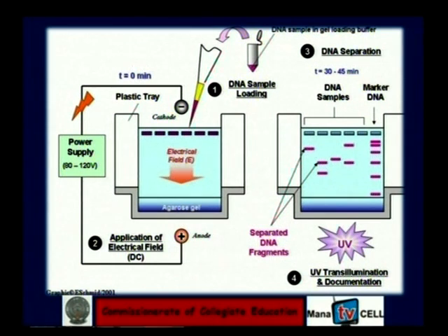After the explanation of the components, let us go to the instrumentation. For the instrumentation, we have to prepare the sample. For the preparation of the sample, we have to weigh the required amount of the agarose and add it to the buffer solution and dissolve it.